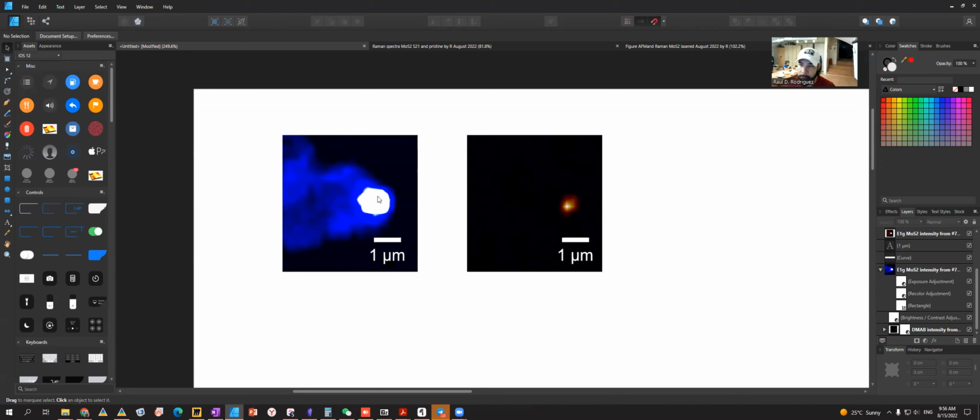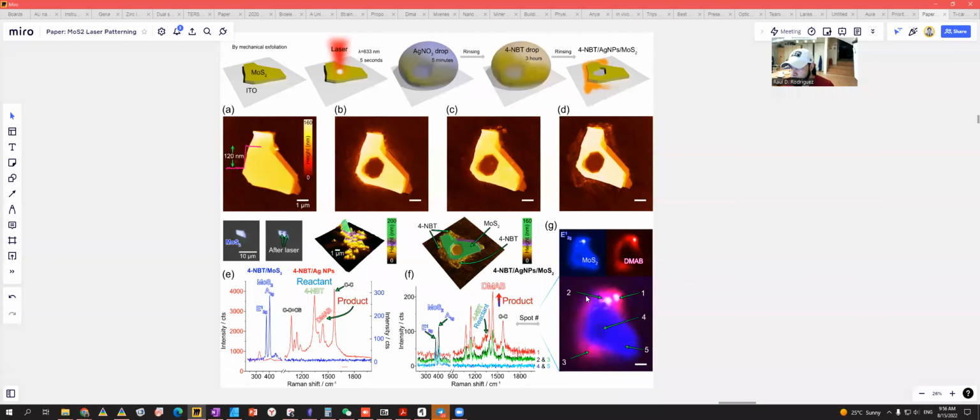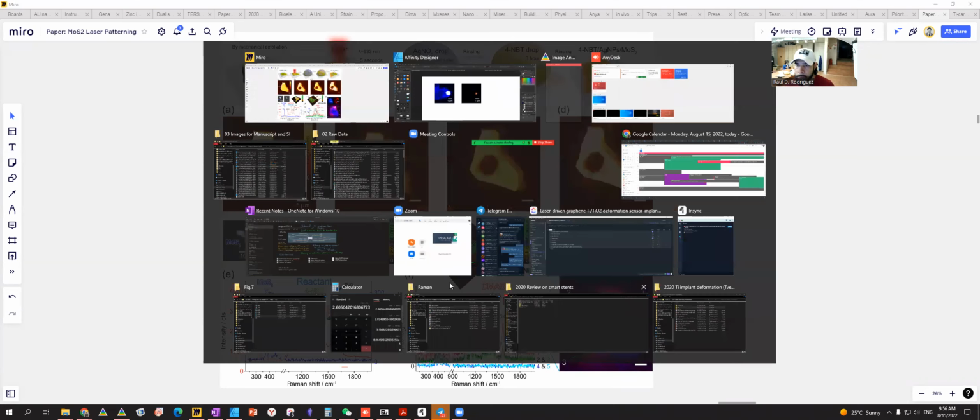Anyway, we need the spectra from this location of interest to be extracted and shown, to see if it's really an increasing background or not. So you don't show only the maps. Typically, you need to show both. You have different spots and you show the spectra. A map alone is not enough. Always keep that in mind.